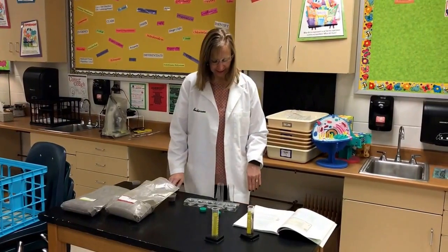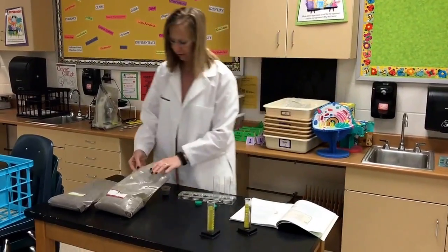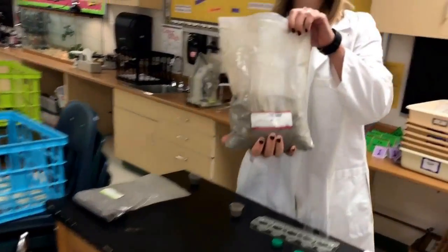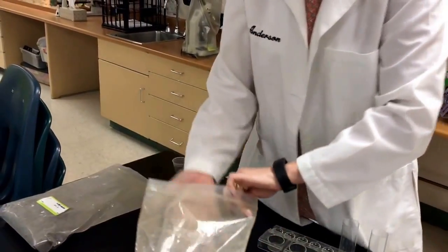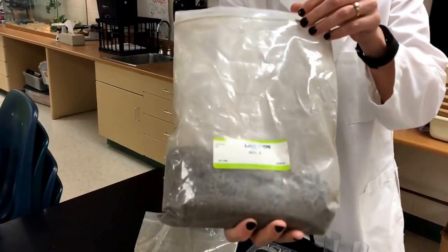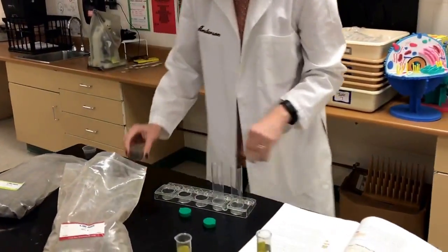Good morning. Today we're going to be taking a look at soil columns. So we're starting with soil A, and we're also looking at soil B. Let me show you what soil B looks like.